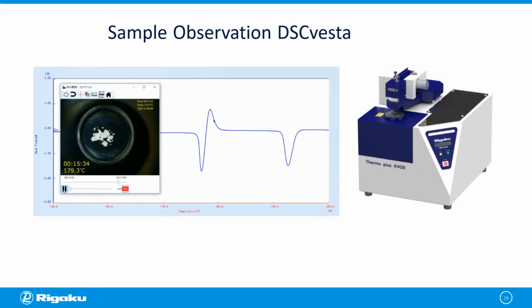One of the common problems in DSC measurement is the interpretation of results when unexpected peaks appear when measuring unknown samples. We can verify this through cycle measurement in DSC, but XRD DSC is the easiest way to understand changes in crystal structure. In XRD DSC, the XRD data is added to the DSC information to determine whether the endothermic peak in the DSC curve is a crystal transition or melting based on the added XRD information.